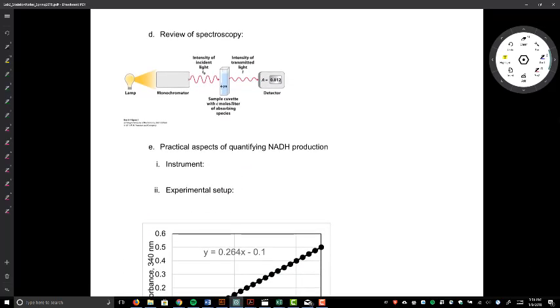So what happens in our UV visible spectrophotometer is that we have a lamp that gives off light over a variety of wavelengths, and then we use the monochromator, probably mispronounced that, to select a wavelength at 340 nanometers or any other wavelength choice. And so that way, only light at a wavelength of 340 nanometers is sent through the cuvette.